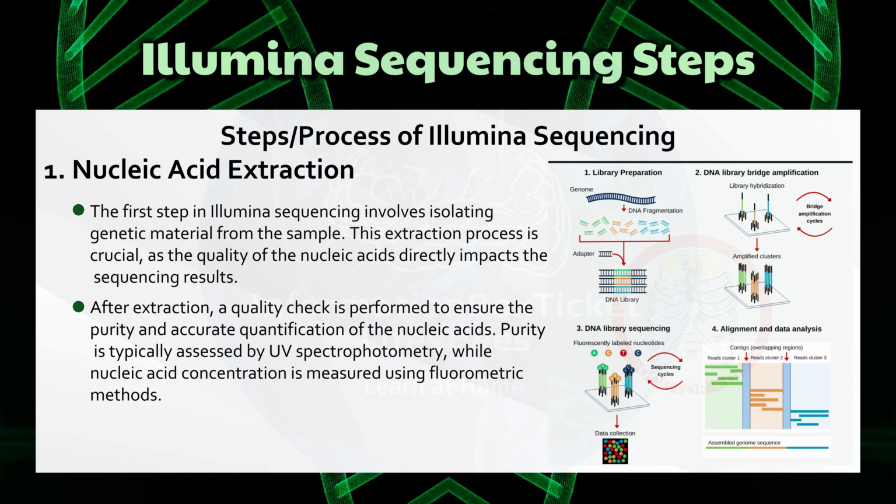Adapters containing sequences for binding to the sequencing flow cell are added to both ends of each fragment. These adapters may also include barcodes, enabling simultaneous sequencing of multiple samples and differentiating them during analysis.